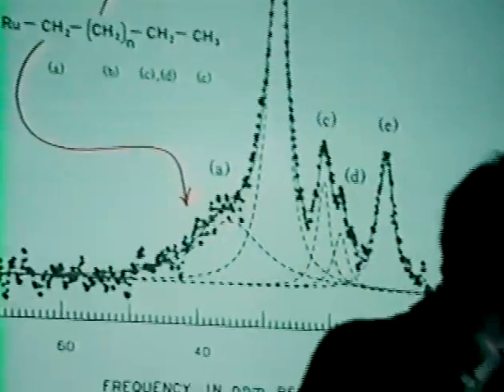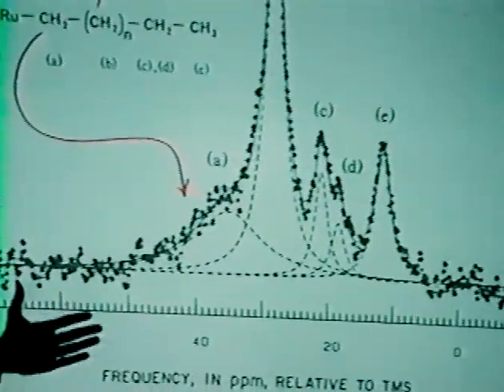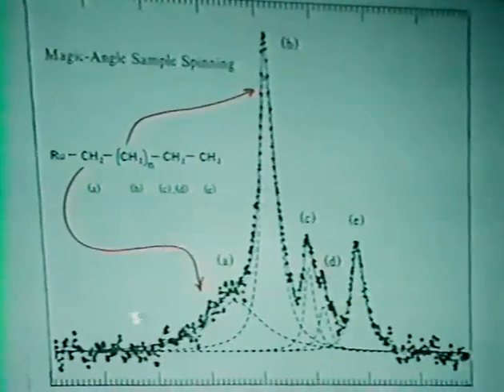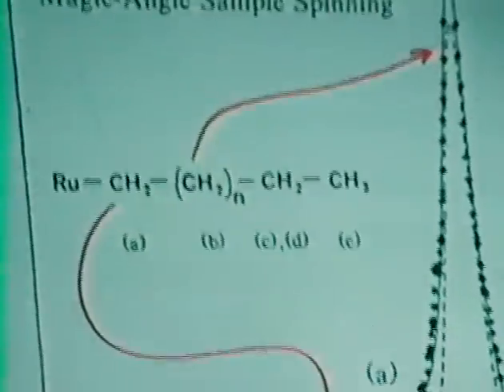If we then look at the alkyl peak, I'm now plotting a spectrum that's approximately 20 times the frequency width as I showed you before. I've blown this up to the detail here, and we're now plotting from 0 ppm over to this region. We find this very broad peak, which had a width of about 50 or so ppm, decomposes into these sharp peaks, and I'm trying to bias your eye by these fittings of these Lorentzian components underneath here.